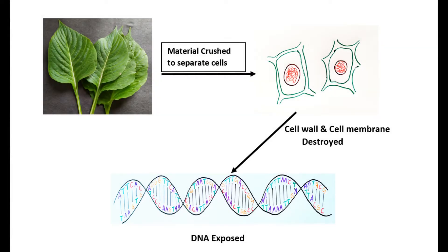The material is crushed to separate the cells. The cell wall and cell membrane of the cell are then destroyed to reveal the DNA, which is then extracted into a form that's visible to the naked eye. In this video, we'll try to extract and isolate DNA from plant materials such as leaves using materials that you can find in your kitchen.